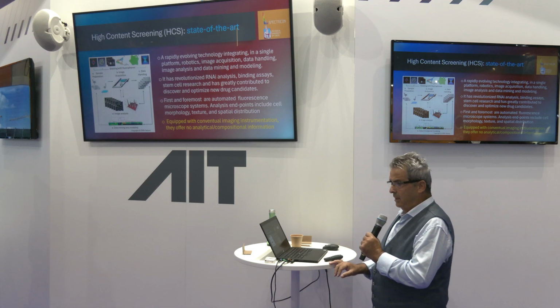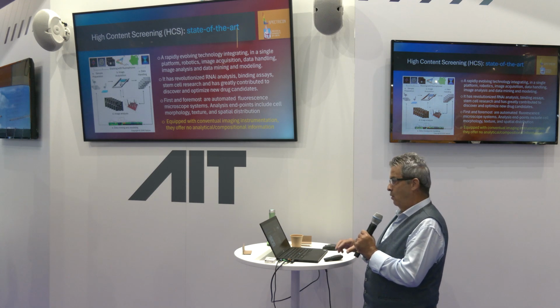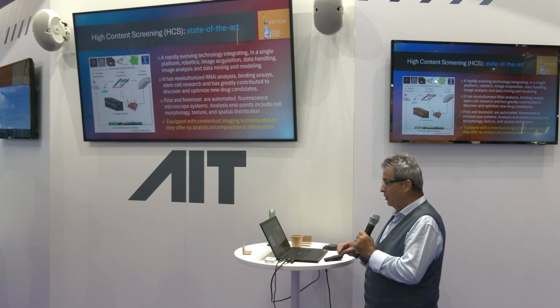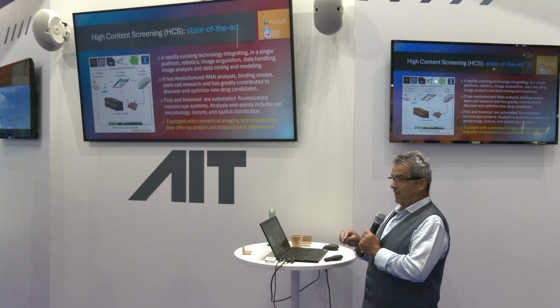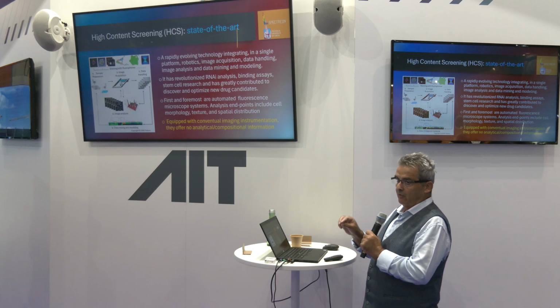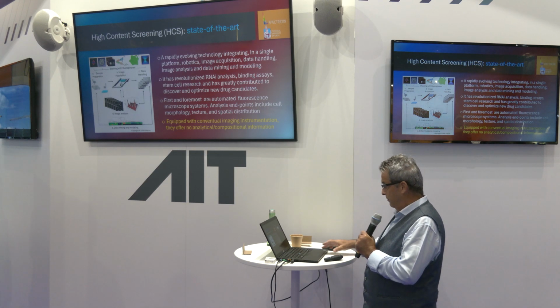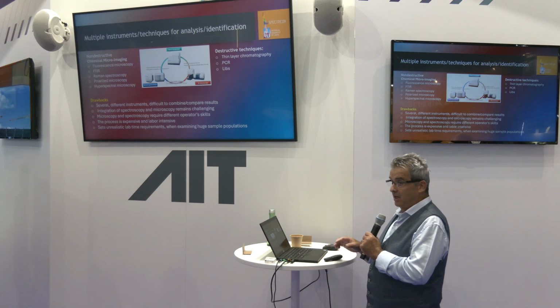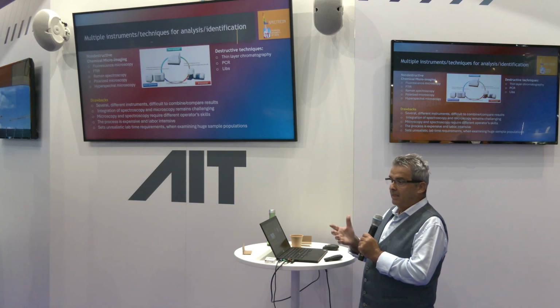However, the main issue of this technology is that it primarily works with fluorescence sensors. So it has one sensor that captures fluorescence for 2 or 3 fluorophores, and these systems are not intended to provide real-time composition analysis in microscopic samples. It's just to identify fluorescent positive or negative biological specimens, to enumerate them and to classify them in different categories. So we try to capitalize on this significant technology.